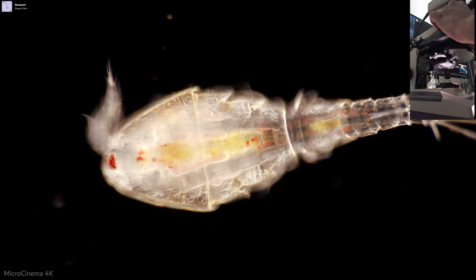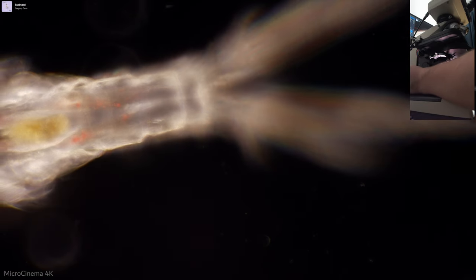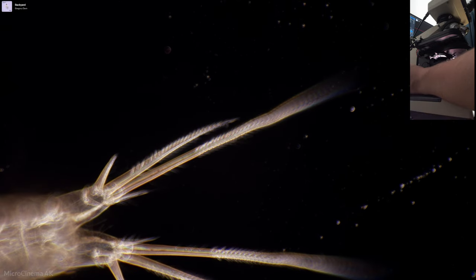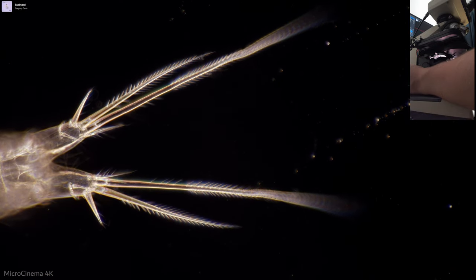And then the really cool thing is I can actually push this all the way to 20X. And this is a 20X S plan Apo, which means we're using a numerical aperture of 0.7.